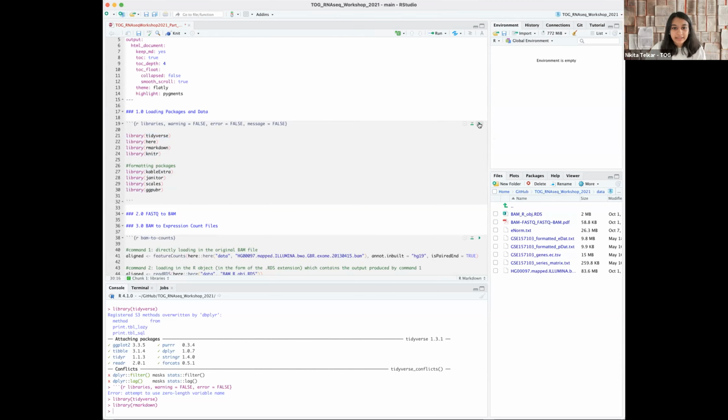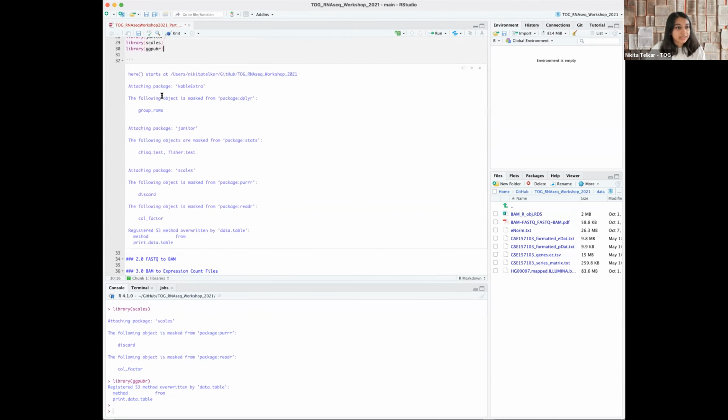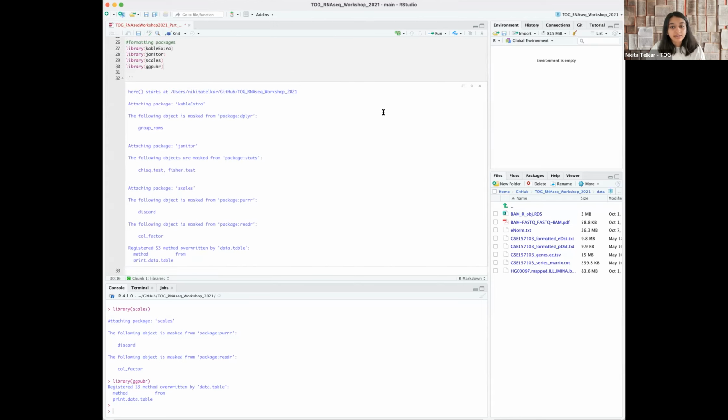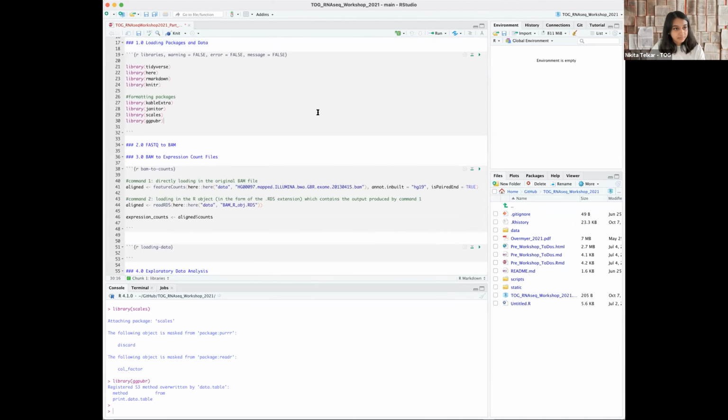And then if you run this, it'll run the whole thing over here. And then you can see here, which is the directory package that we had, it says that it starts at this place over here. So that means that it's much easier to load in files if we go to our main folder here. And I'll show that how in just a minute.